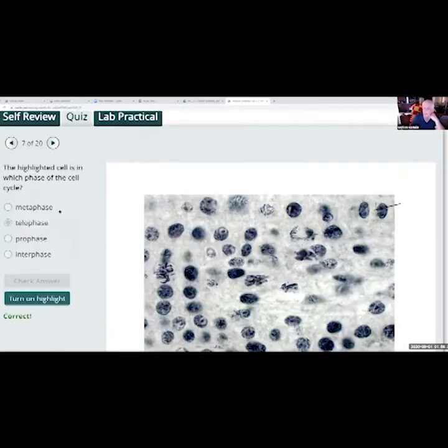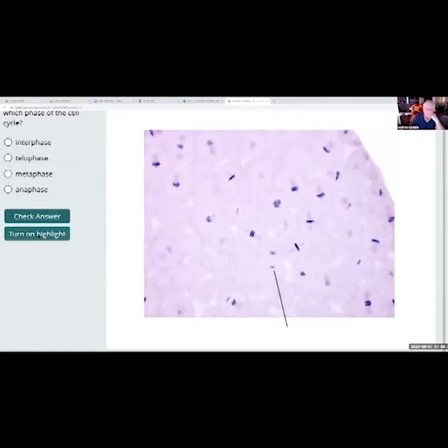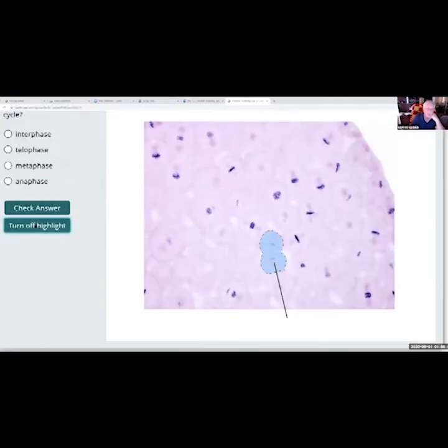And the blowfish here. Okay, that's cell right there. What would that be in? Anaphase. I'd say it either looks like late anaphase, telophase. Yeah, anaphase or telophase. So I can still see some of the spindles, but I think I can see invagination here and here, and a little bit of line there. So I'd probably say telophase.